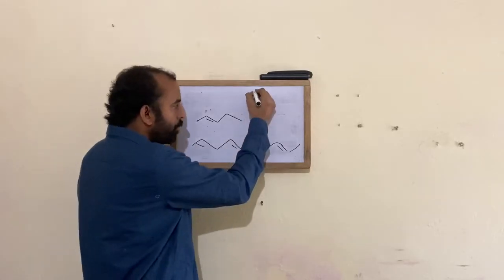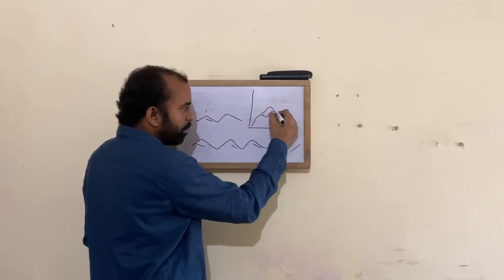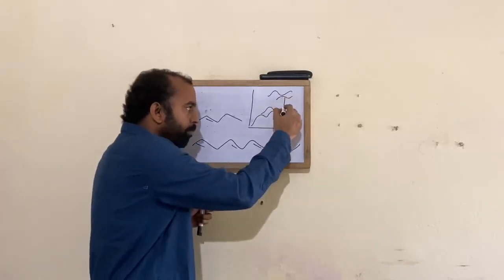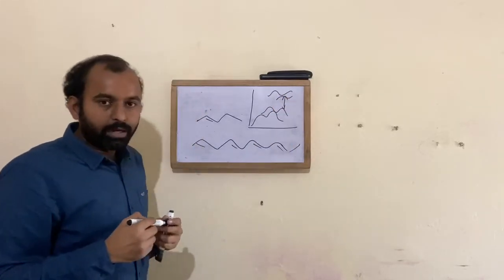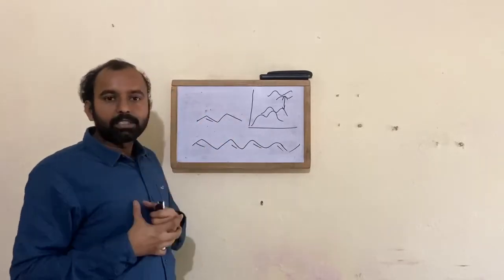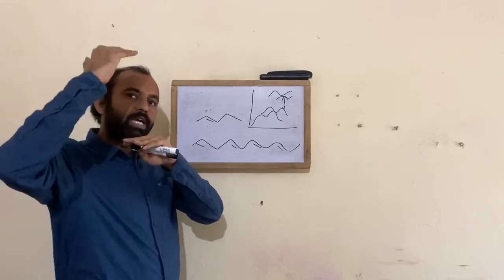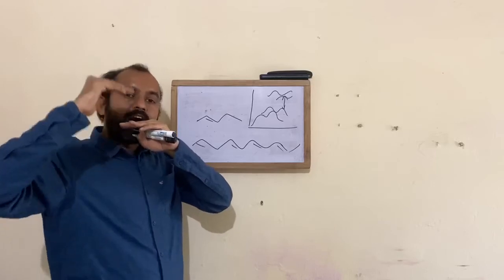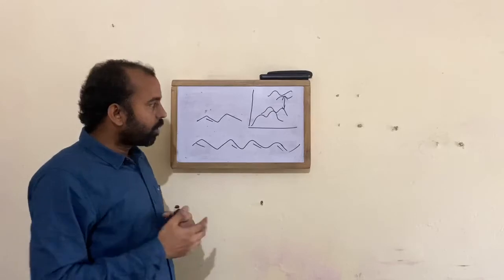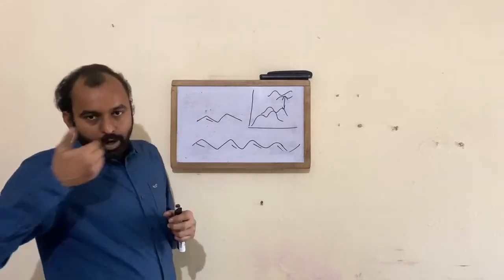That means you have an energy gap between the excited state and the ground state. This energy gap is minimum when your molecule is highly conjugated. So what happens, this energy gap is minimum. That means the molecular tumbling from the ground state to excited state is very fast. So that's why you have a spontaneous emission of light. That technique is called spontaneous emission of photons, which are longer in wavelength, lower in energy.